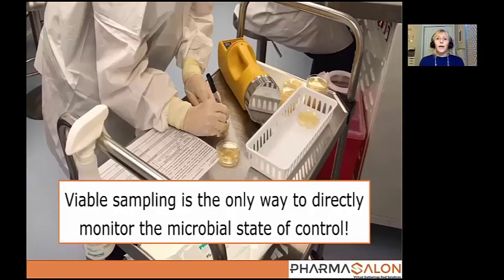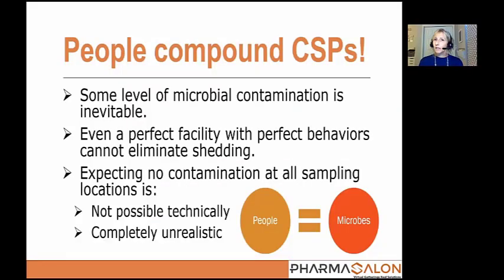I want to reiterate here that viable sampling is the only way to directly monitor the microbial state of control. And this is why doing sampling more frequently than what the chapter is going to require ends up being really important, so you can understand the microbial state of your compounding environment. I do want to review a couple of things here before we get into talking about ISO 8 specifically.